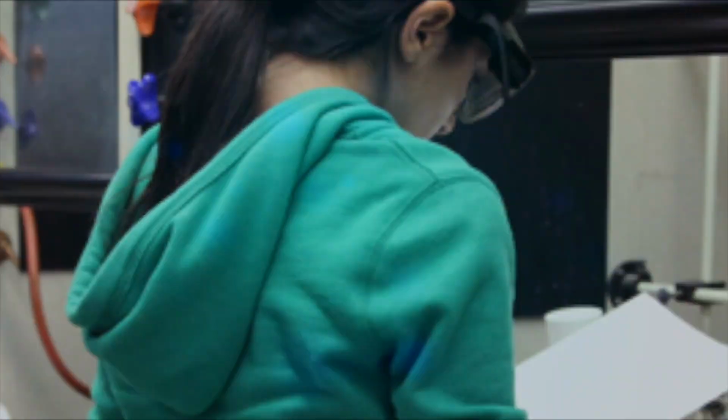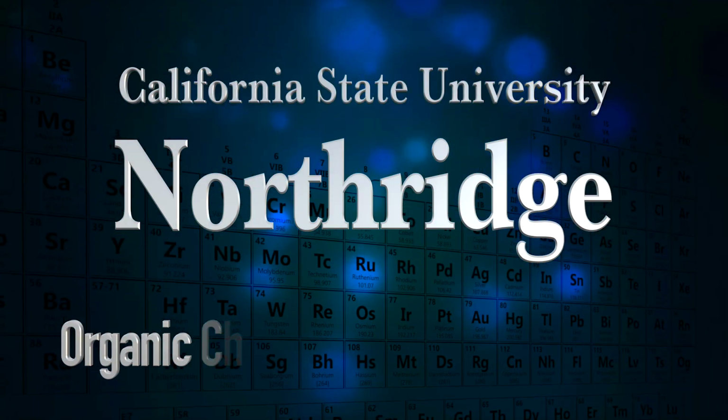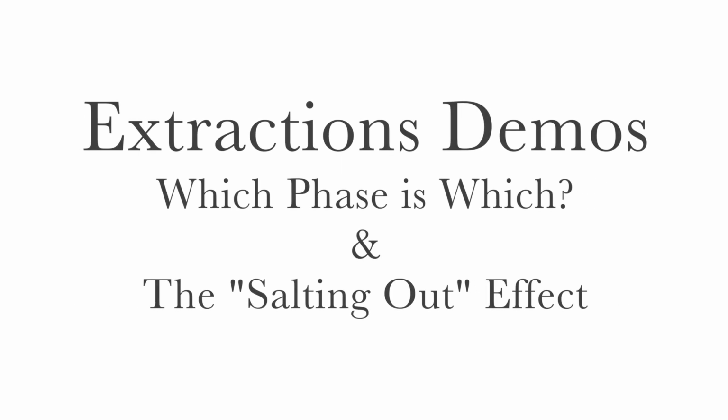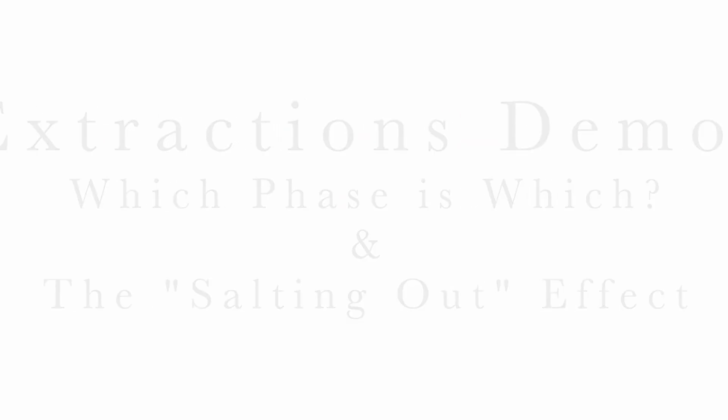Today we're going to be doing 2 extra little demonstrations to go along with the extraction lab. Let's get to it. Extraction demos. Which phase is which and the salting out effect.